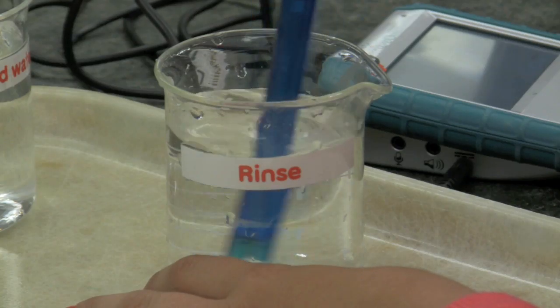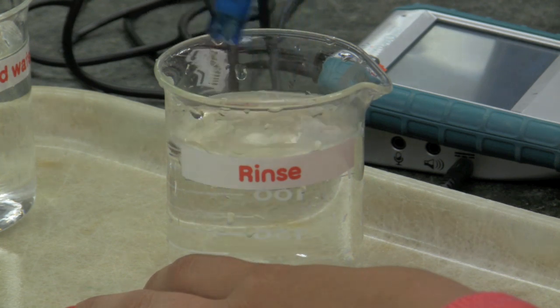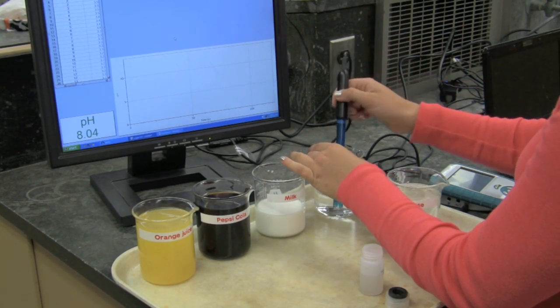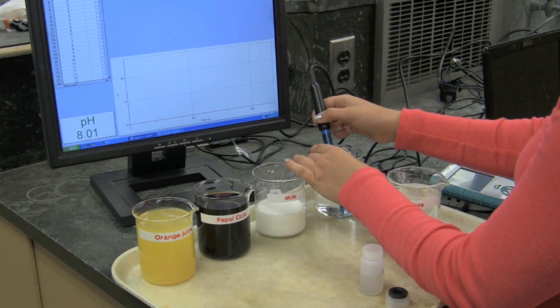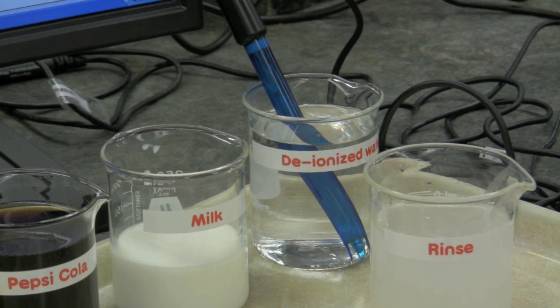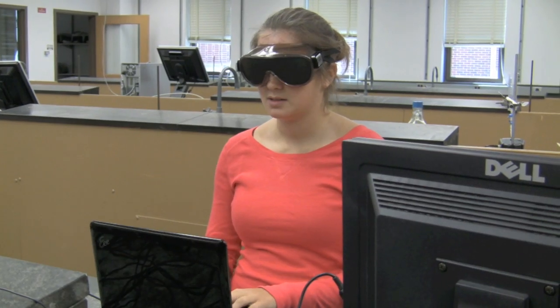She removed the probe from the milk and is placing it in the rinse again. After a few seconds, she places the probe into a beaker of DI water directly to the right of the beaker of milk. She will record the data given by Logger Pro in the Word document a final time.